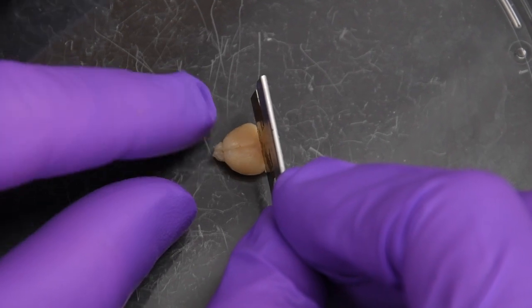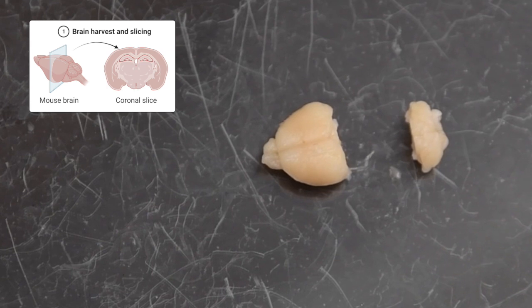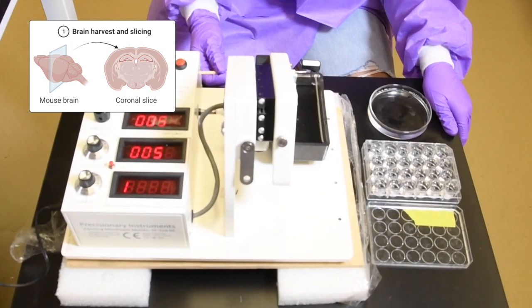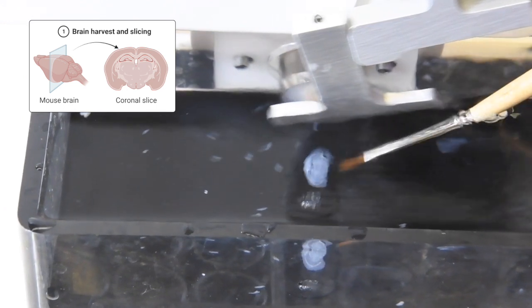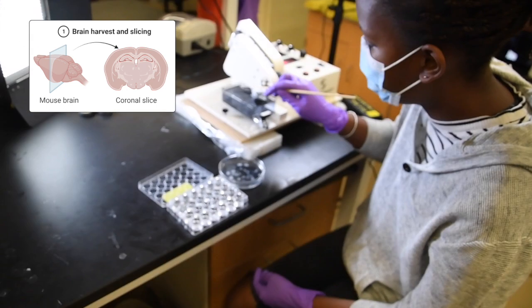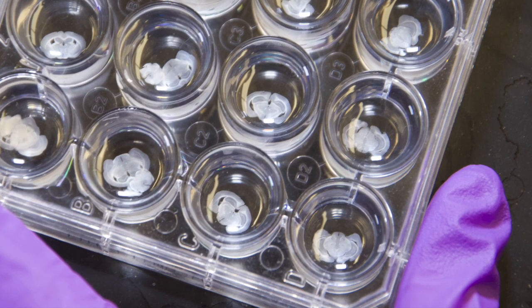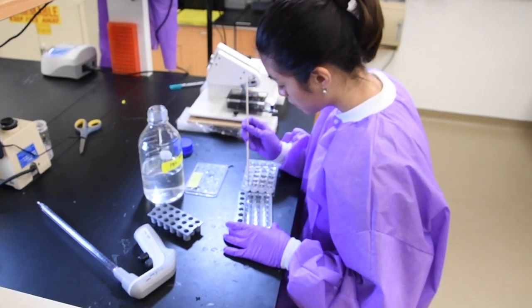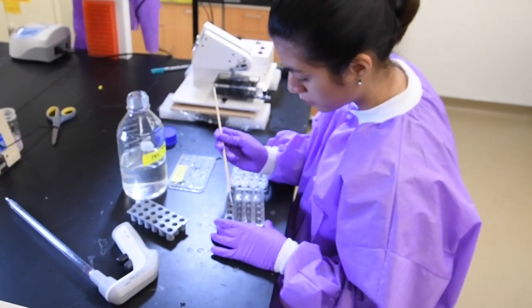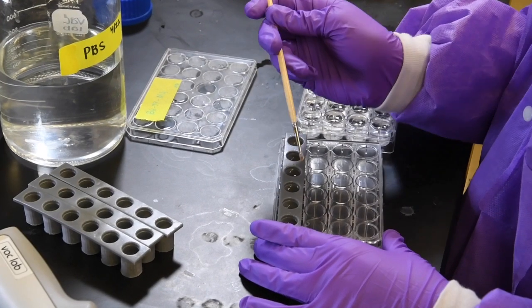Here you can see a whole mouse brain that is being trimmed in preparation for mounting in a vibratome. As the name implies, the vibratome slowly moves a vibrating blade through the tissue, cutting very thin sections, typically between 10 and 100 microns in thickness. Once the brain has been sliced into sections, those sections can be collected into wells containing buffer solutions. Once the tissue sections have been collected, they are cycled through a series of washes and antibodies. Here, we are using wells with mesh bottoms to easily move the sections through the relevant washes and antibody solutions.